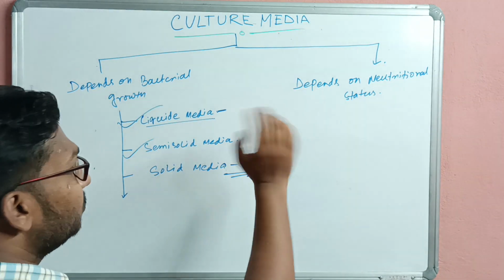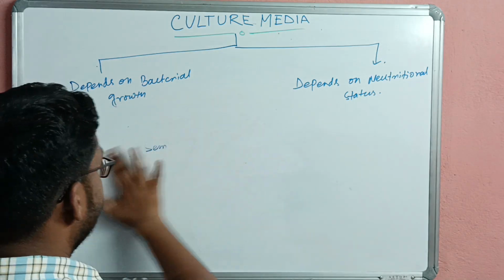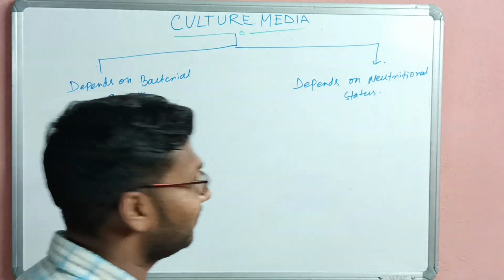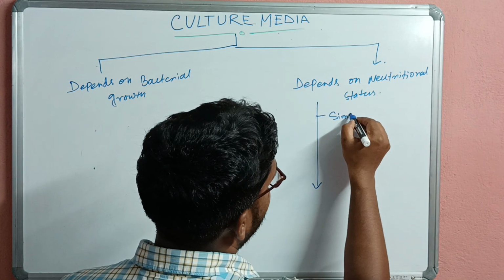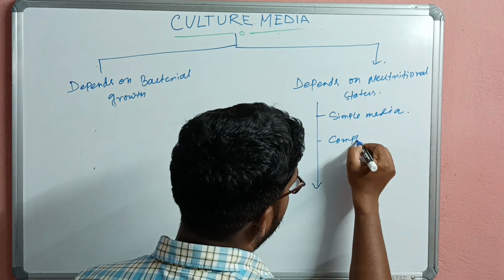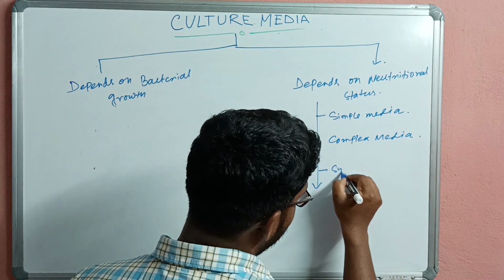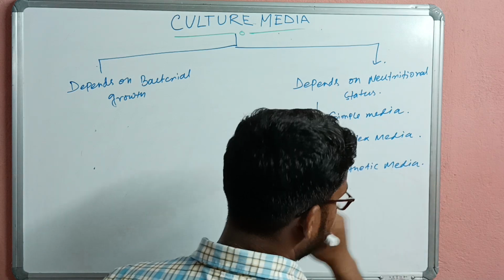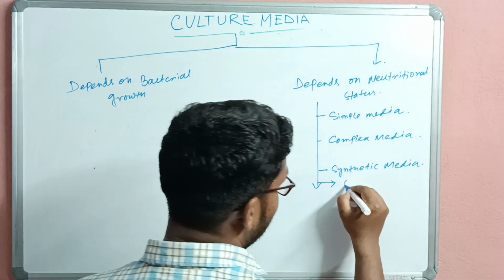Now we come to nutritive value. Depending on nutritional status, we divide media into simple media, complex media, synthetic media, and special media.